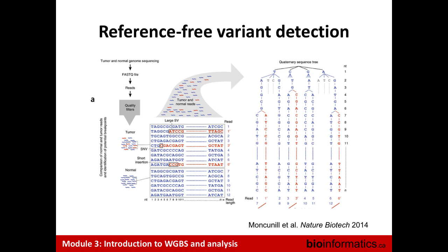You have a whole bunch of tumor reads, methylated tumor reads, that you don't have in your other sample. So you identify that group of reads, and then you say, where did they come from? So you would still use the reference, but sort of downstream. And I would think that especially in some of these regions where mapping was a problem because you have low complexity and things like that, you might see a pattern that you would miss in the other approach because they fail that mapping step, right?